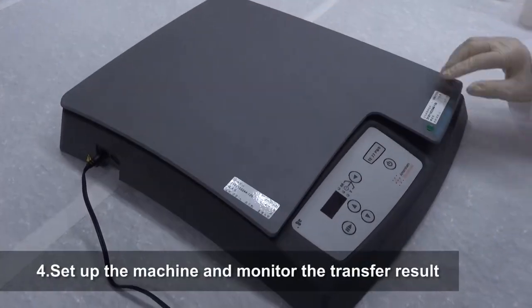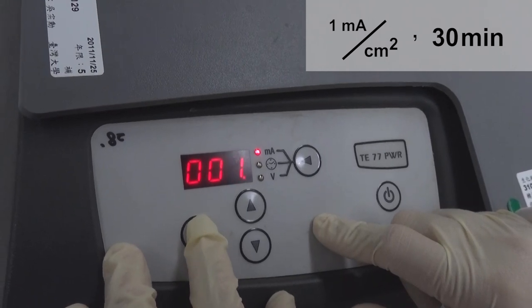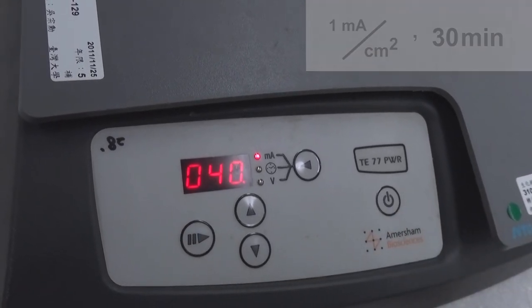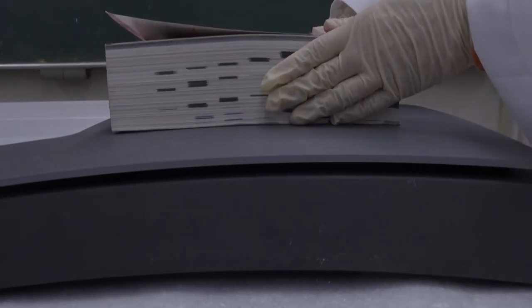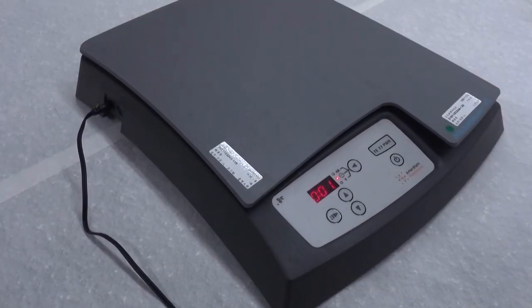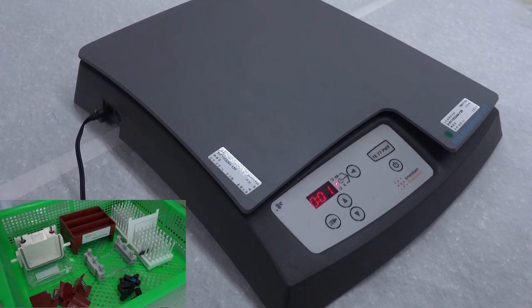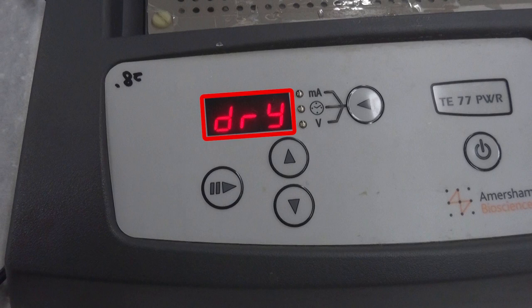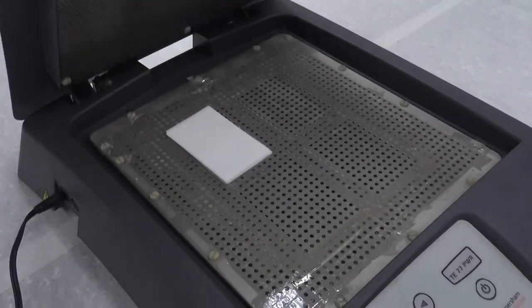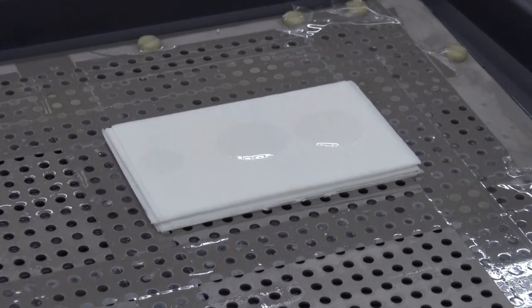Close the lid. Set the current to 1 mA per square centimeter based on the total area of the gel and set the time to 30 minutes. Start the transfer procedure. When multiple gels are transferred simultaneously, use a capped bottle containing 1 liter of water or a thick book to press down the lid and improve the transfer efficiency. Wash and dry all used equipment and put them back while waiting for the transfer to complete. The machine will show a dry warning if the transfer buffer has dried out; if this occurs, open the lid and add a few drops of transfer buffer at the center of the filter paper on top before resuming transfer.